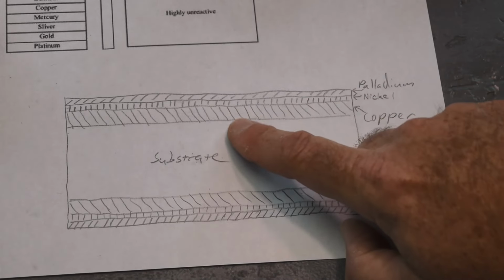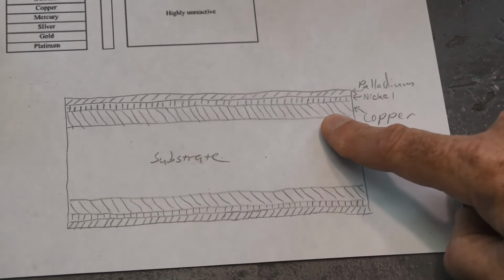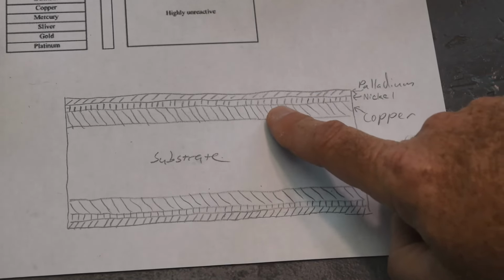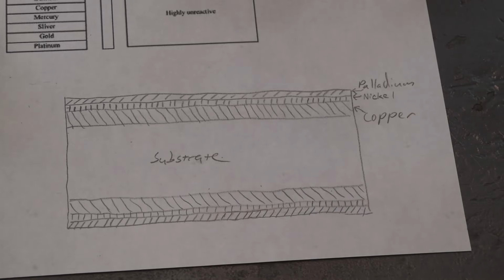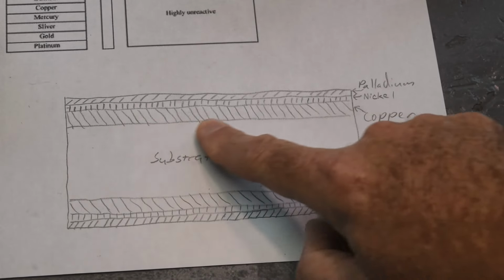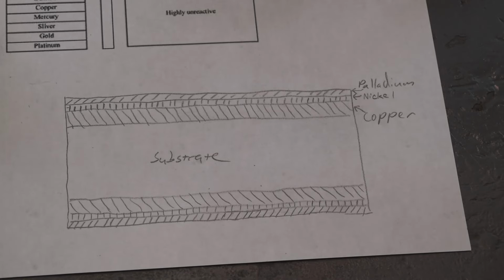And fortunately, I didn't put so much nitric acid in there that the reaction went to completion and dissolved all the copper and then started dissolving the palladium. I think the copper layer is pretty thick, and it takes a lot of nitric acid to dissolve copper. So I think what happened is we only got partial dissolution of the copper layer, and basically none of the palladium, or at least very little of it, has gone into solution. So that's my best guess as to what's going on.